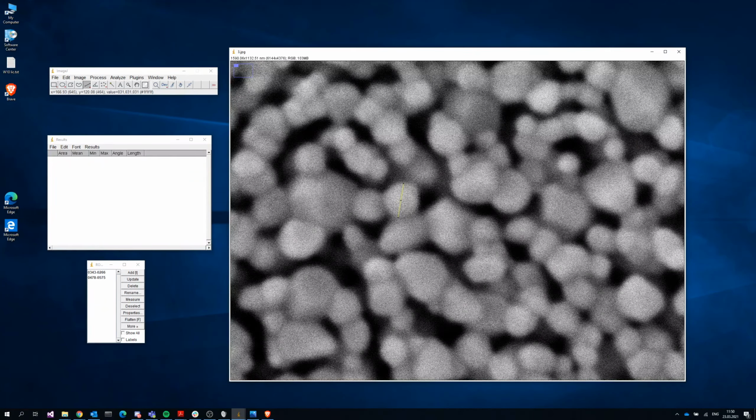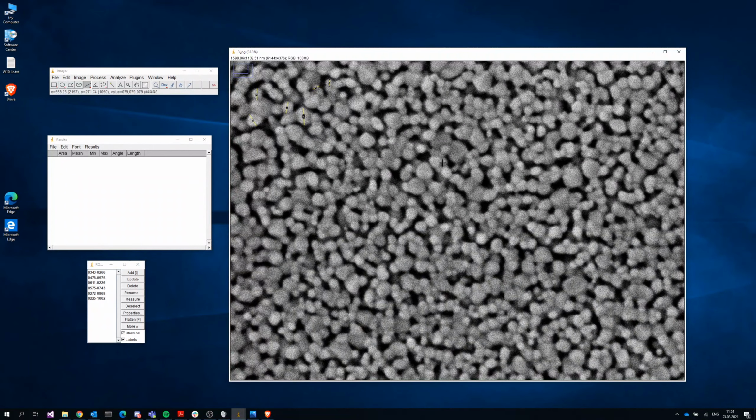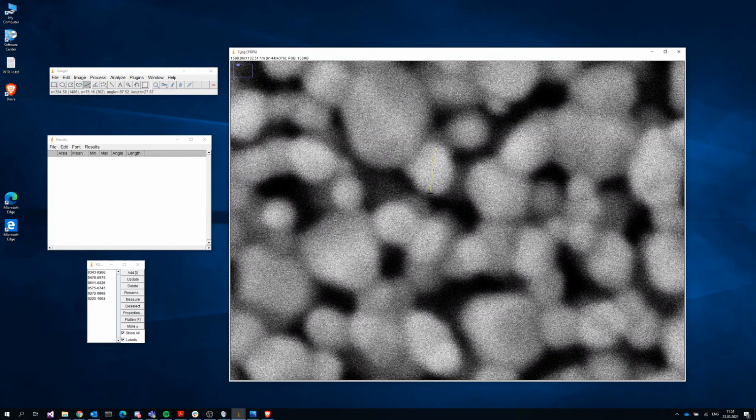We add a second image, so now the other one disappears. So what we can do is press Show All. It keeps track of every single unique measurement you make, and we keep going, keep going, keep going. Of course, this is a very primitive way to do this, but it's a good introduction to the actual grabbing of meaningful statistics of these sizes.